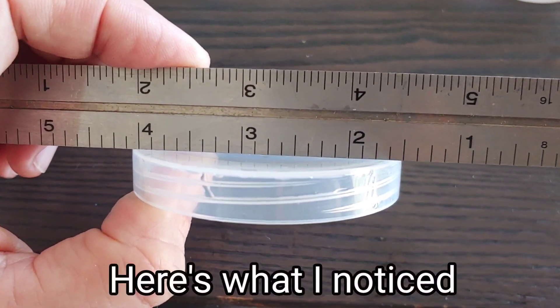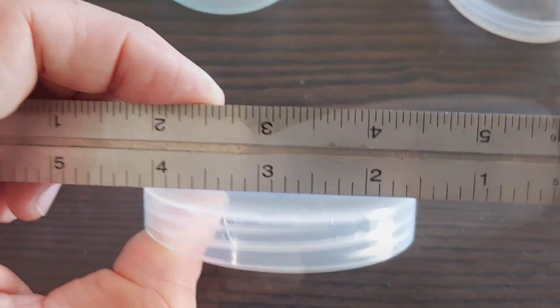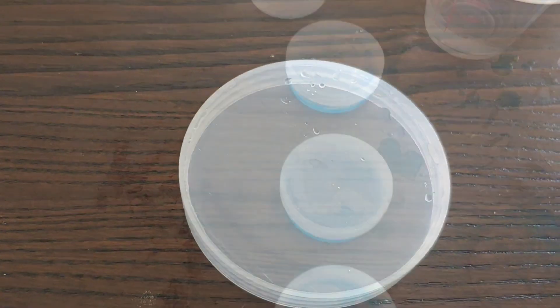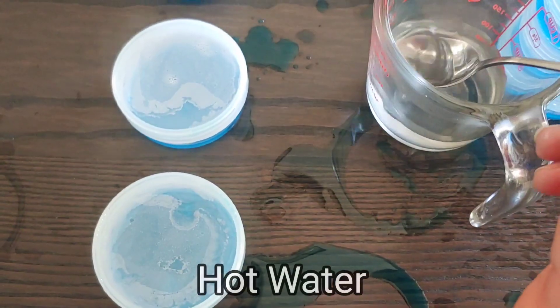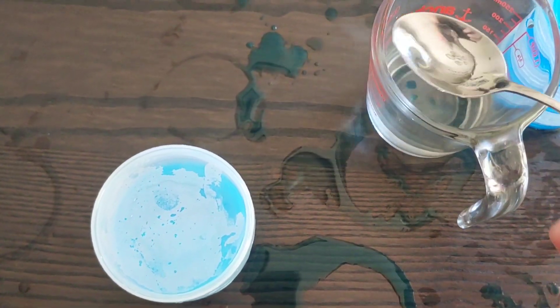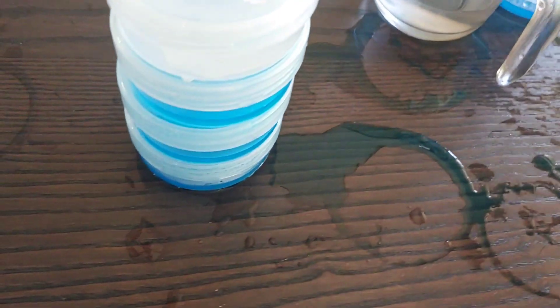I don't know if you can see it, but this is concave — it's pushed downwards, so it doesn't really make contact. We need a bead of water in there. I think that's going to fix it. I know I'm making a mess, but here's what I do: take a spoon, put some water on it, lay the next one on top, some water on it, next one on top, more hot water on it, next one on top. Now we'll see how that goes.